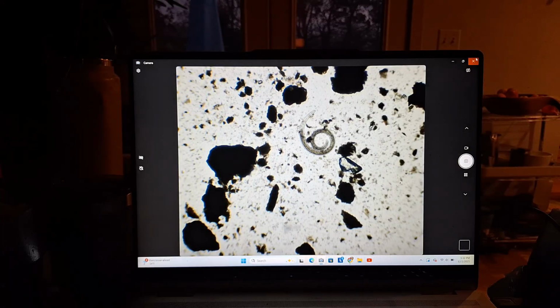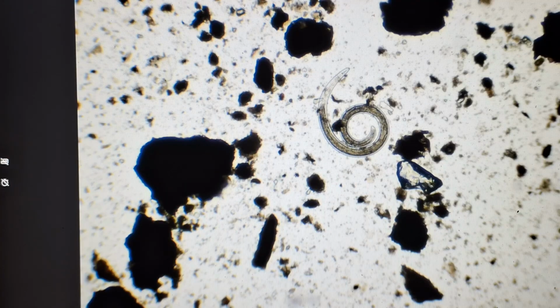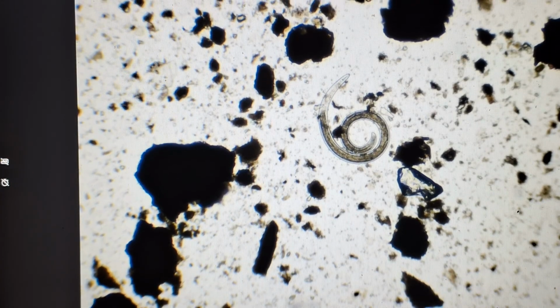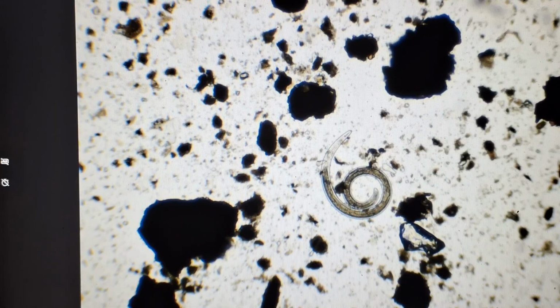I've had a look around. It's a nice sample. I've got a nematode up now, so we'll start there. We're all the way out with the microscope now, looking at 40x, so 40 times magnification. That circle we're seeing in the center is the nematode. There's 5 types of nematodes: bacterial feeding, fungal feeding, root feeding, predatory, and opportunistic, I believe. I think I'm missing one there. We'll check me on that.